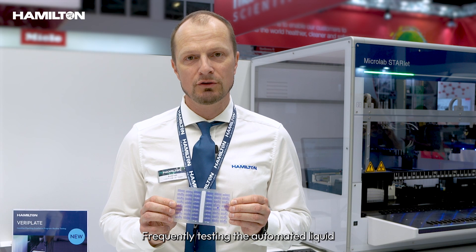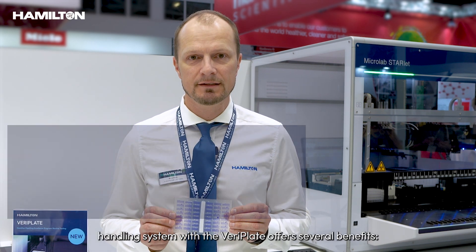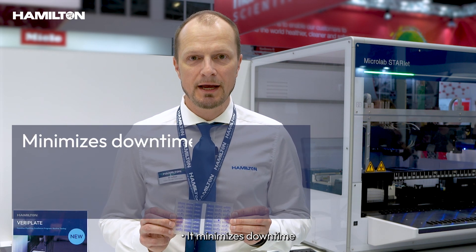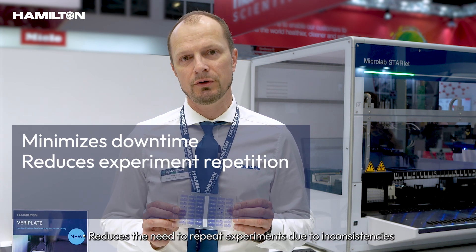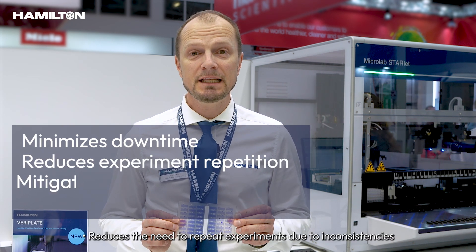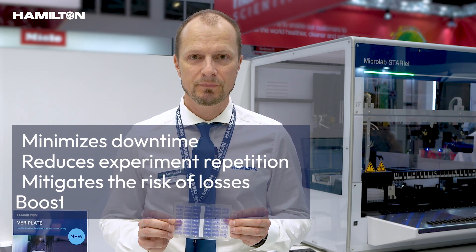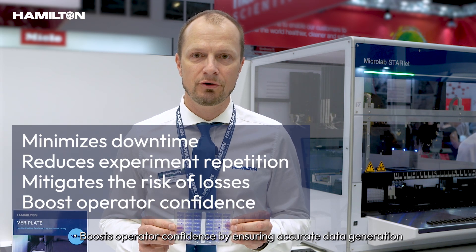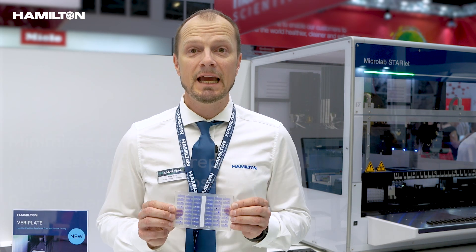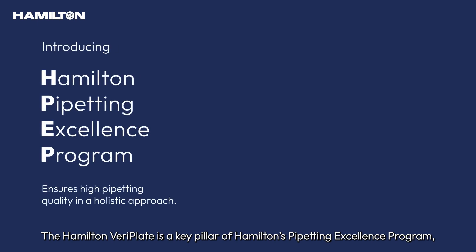Frequently testing the automated liquid handling system with the VeriPlate offers several benefits. It minimizes downtime, reduces the need to repeat experiments due to inconsistencies, mitigates the risk of losing valuable samples and data, and boosts operators' confidence by ensuring accurate data generation.